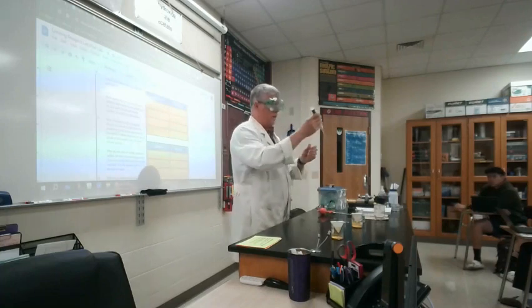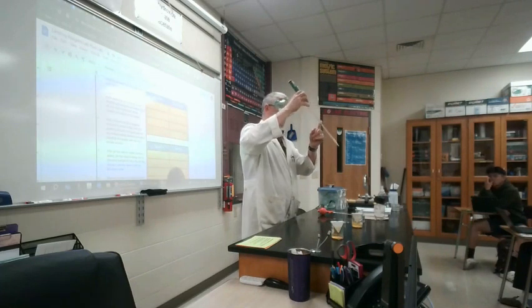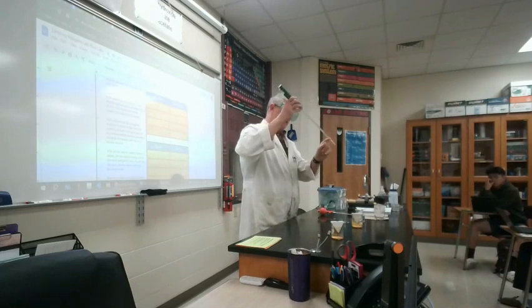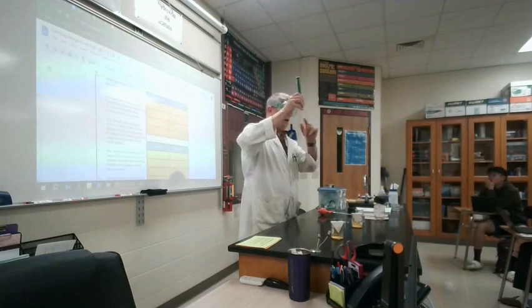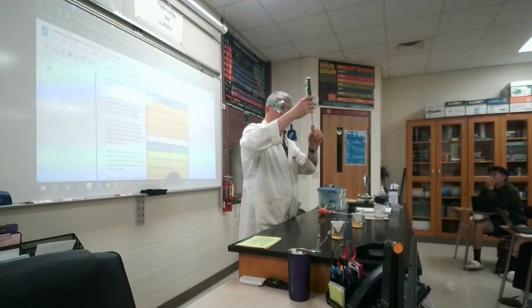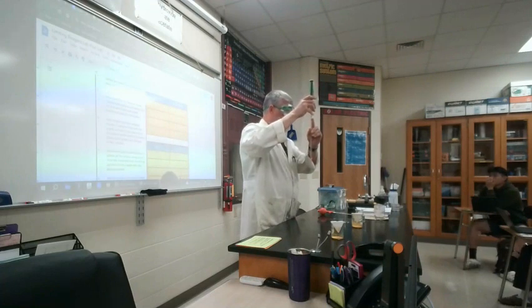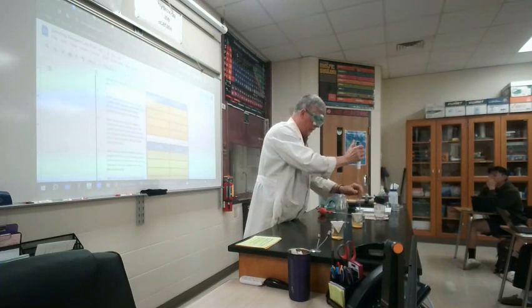So, this is marked out. It goes from 9 to 0 on one side. It goes from 1 to 10 on the other side. By the way, if you go up here, you are going over. That is why it goes 10, 11, 12, okay? And it goes into minus numbers here. We want exactly 10 milliliters. You put it into the container.